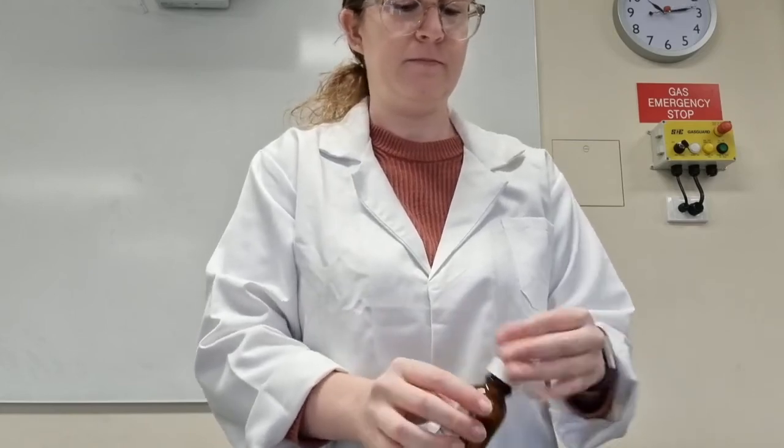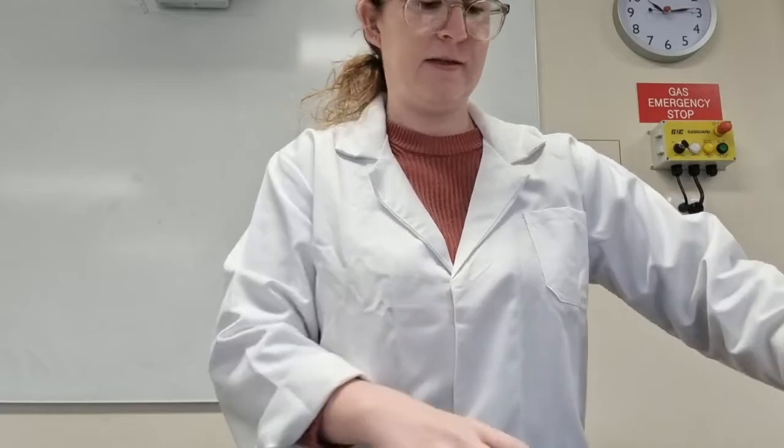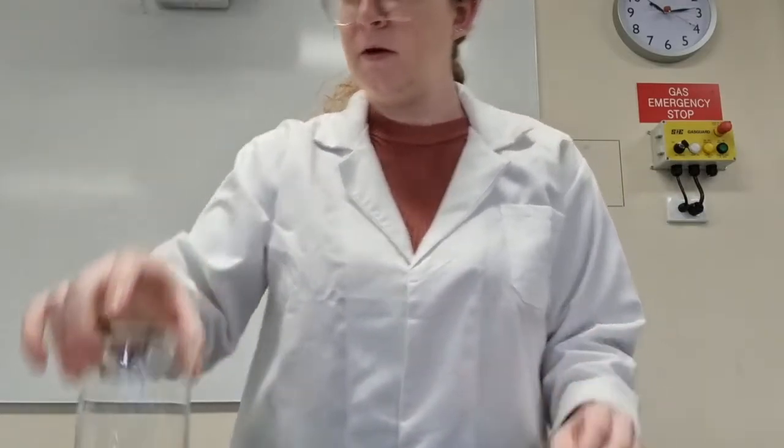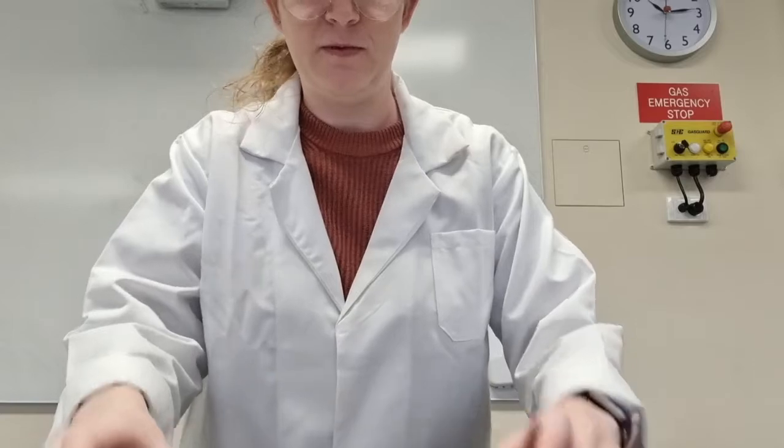Alright. So there's 50 mils of the sodium hydroxide. What I need to do now, I'm also going to place both the beakers on the electronic balance and determine their total mass. So I'm going to record that. Well, you're going to record it in the table. I'm not going to write it down.